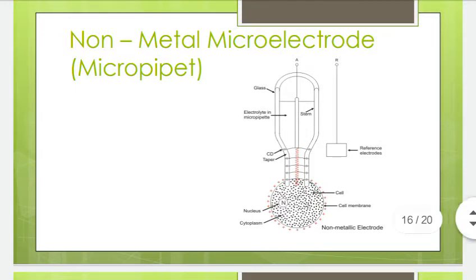So there will be friction generated, and this friction between the wire and the stem of the micropipette and the fluid surface tension hold the micropipette on the wire. The other end of the metal wire is mounted on a rigid support, and the other end is resting on the cell.